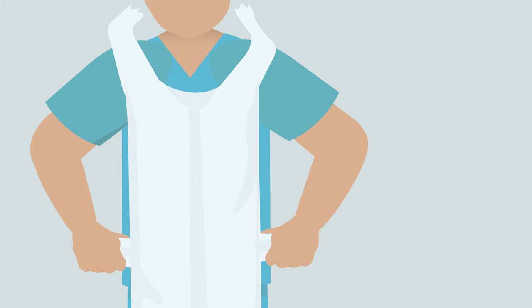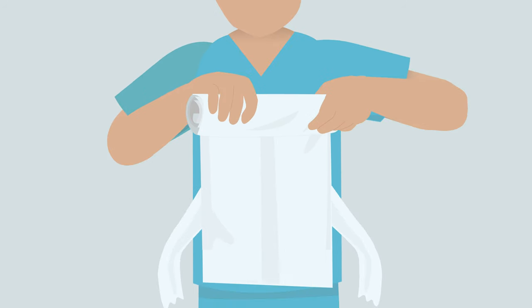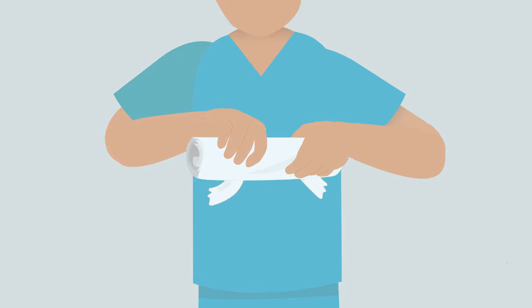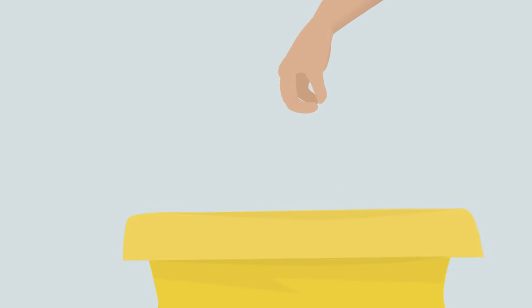Dispose in yellow clinical bag provided. To remove apron, break the neck loop and waist straps. Avoid touching the outer surface of the apron with your hands. Roll the apron downwards from your chest so the contaminated outer surface is folded inwards.